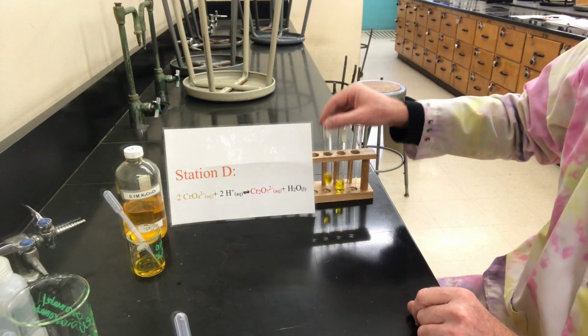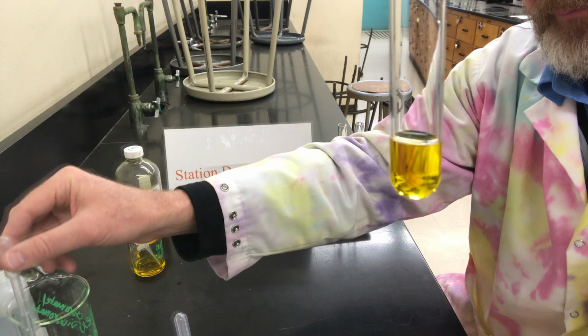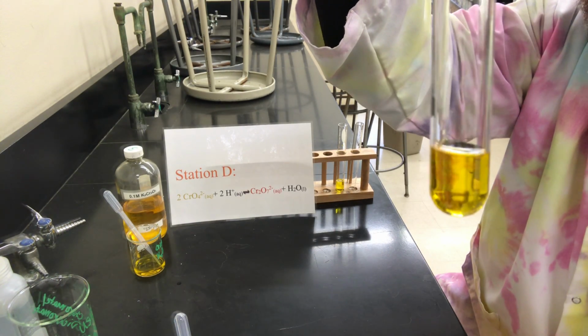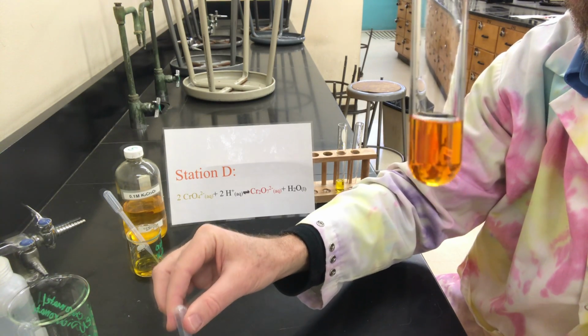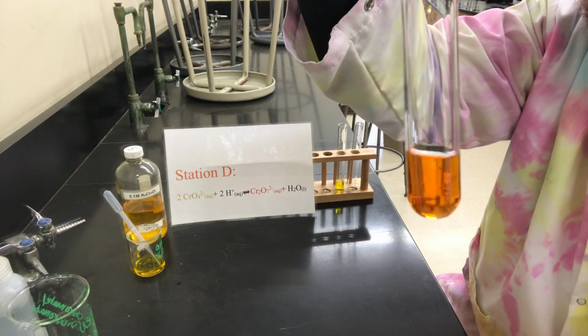Let's add some more nitric acid to it, right? So here's our same test tube, and adding some, we can see it changing color and turning more orange. And we'll go right back again with some more sodium hydroxide.